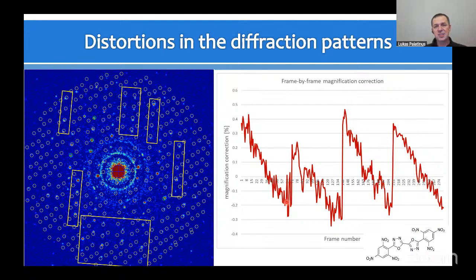So the crystal is swelling and this is a typical effect of radiation damage. And again, this is in percent. So the total error or change in the dimensions of the unit cell can be almost 1% or more than 0.5%, simply as a result of radiation damage.